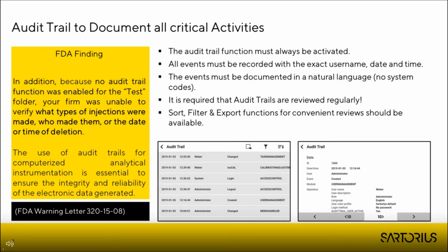Yeah, in the next warning letter here, the FDA mentioned the importance of the audit trail. They write directly: the use of audit trails for computerized analytical instrumentation is essential to ensure the integrity and reliability of the electronic data generated. And therefore, you should always make sure that your computerized system has an audit trail and that it is always activated.